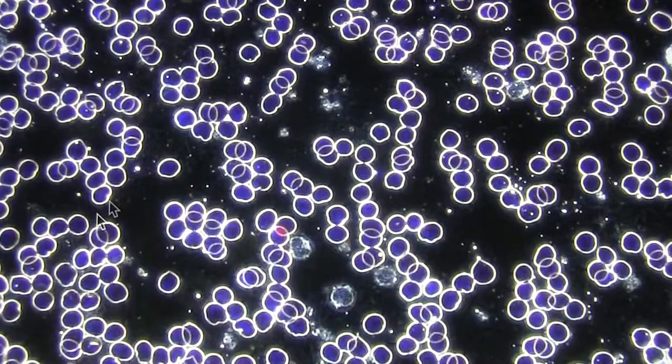After that last sample of blood we looked at, the person did a 1-hour treatment with a frequency device called a Healy, which sends microcurrent and specific frequencies into the person's body. That was 60 minutes, on a program called Immune System. Immediately after that treatment, I looked at her blood, and this is what we saw.